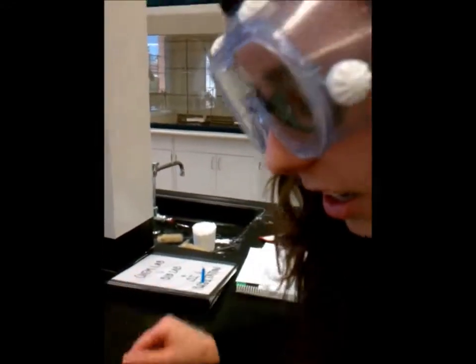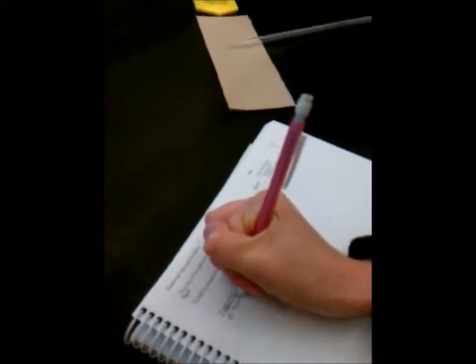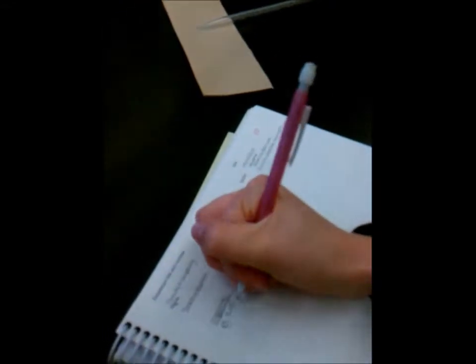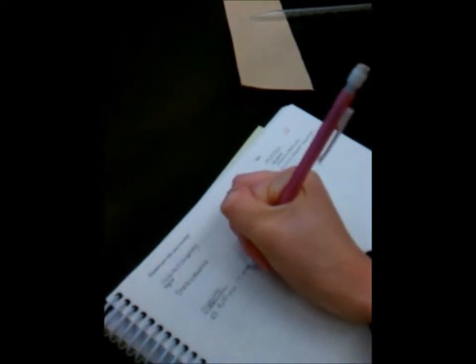Now I'm going to record my data. I had 9.10 milliliters minus 8.10 milliliters. So now what's left in my 40 milliliter beaker is 1 milliliter.